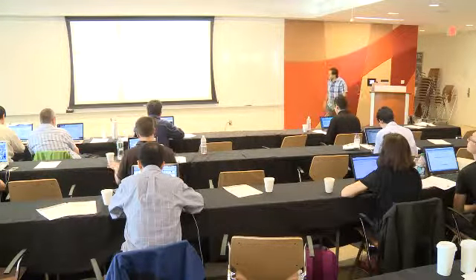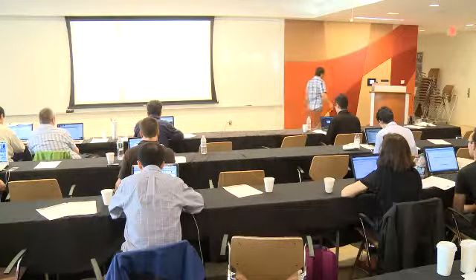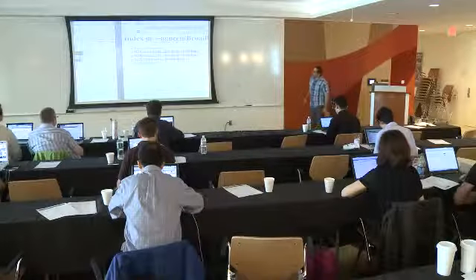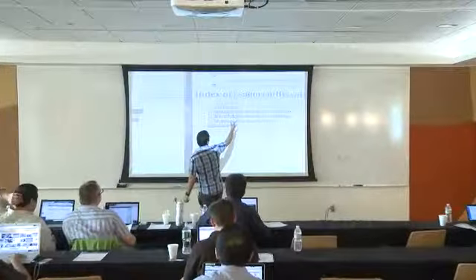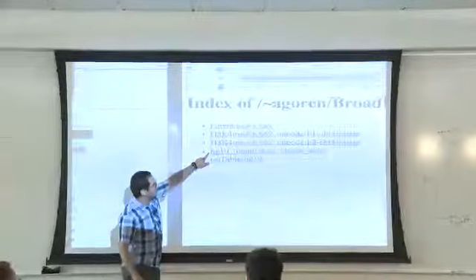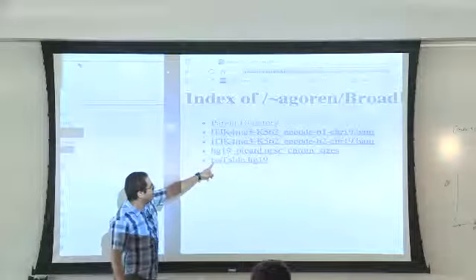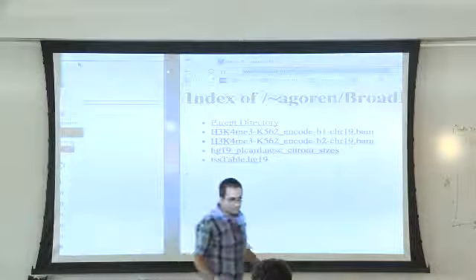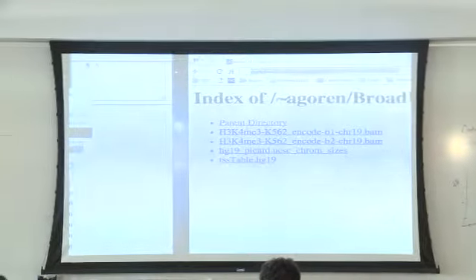okay, so if you go to the link that I've sent you before, there should be an email, but sometimes these emails take a bit longer. I just made a directory, and I named it GenePattern, and in it these 2 biological replicates, the chromosome sizes, which in a second I can explain why you need, and the bed file that is the transcription start site table. So this should all be in the public website in case you can't log into the internal one.